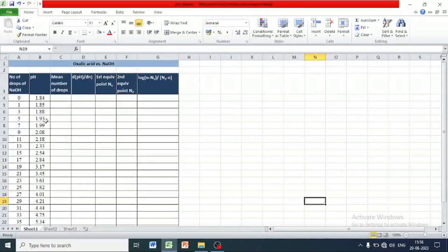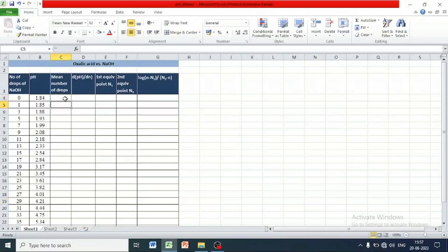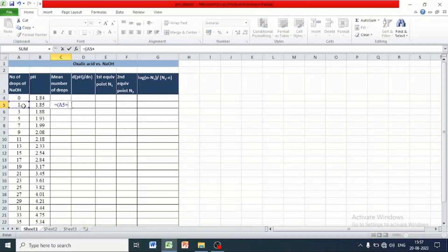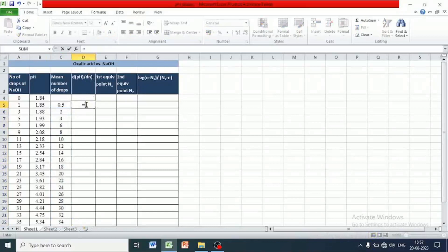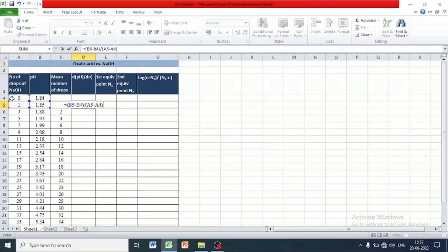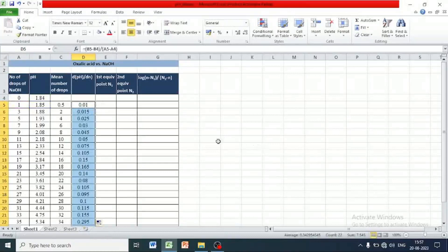Now let us plot the data. You can see the number of drops of NaOH data and corresponding pH values. First, we have to calculate the mean number of drops. By double-clicking at the right bottom corner, we get all the values. Similarly, dpH/dn values can be calculated. Once again, by double-clicking at the right bottom corner, you can get all the values.